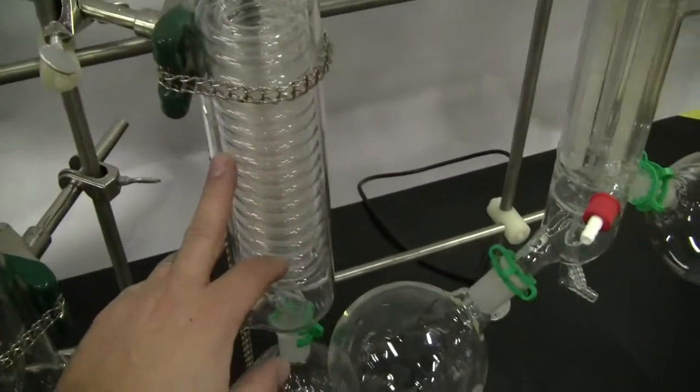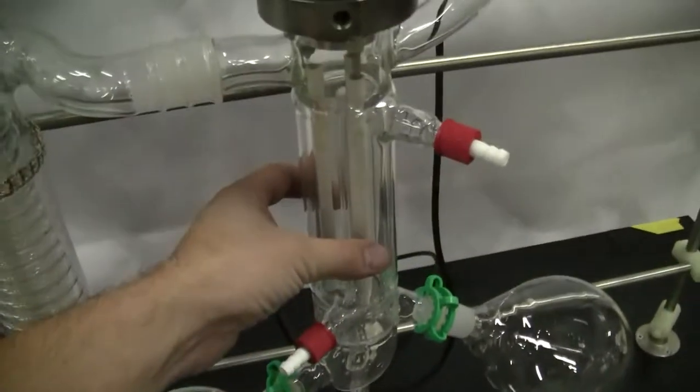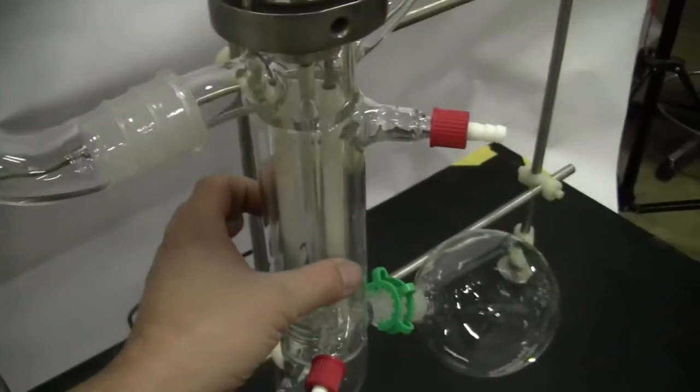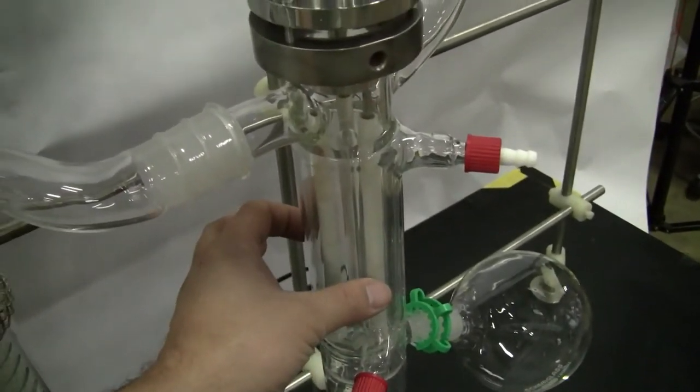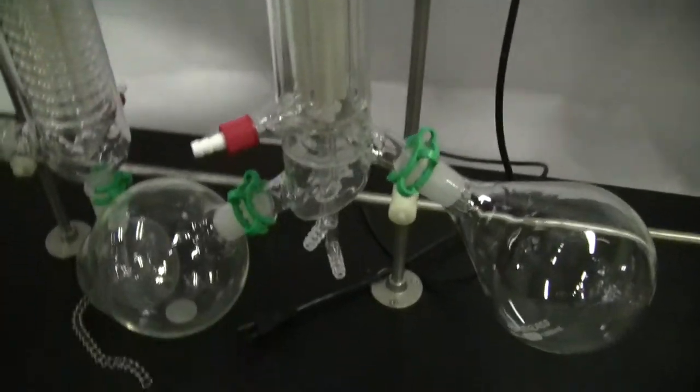First condenser, second condenser. Receiving flask on the bottom. The diameter here is 2 inch. The system looks to be in excellent condition.